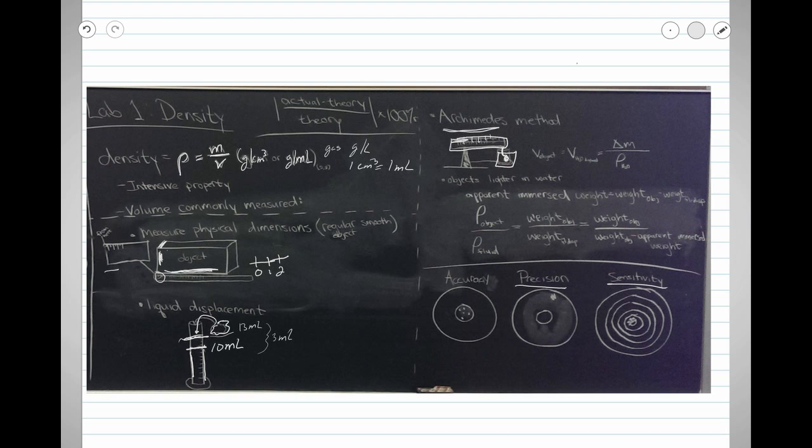The first thing that's going to happen is you're going to get a metal object. It might be stamped with a code, which will help us to identify it, but it might not. And either way, you need to record detailed observations about your object: size, shape, color, whether it feels light or heavy, and whether it has a code or not, and if it has a code, what the code is.